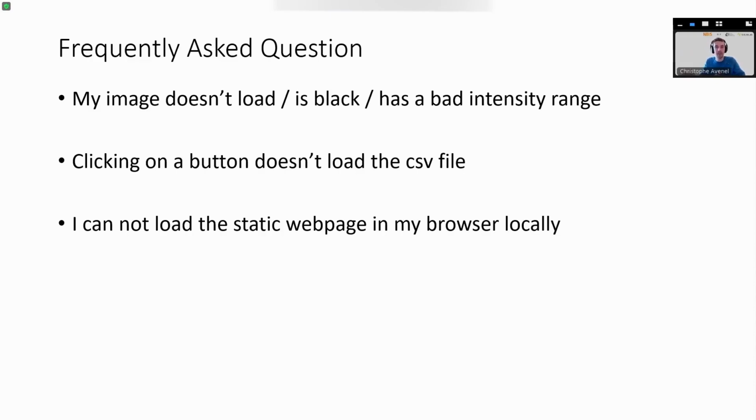But sometimes it can fail. It can fail to find the correct range, or your format is not recognized by TissUUmaps at all. And TissUUmaps is using the VIPS library to convert it, so some images are just not supported. So the best thing is to use other tools that are good in converting images. For example, you have Bio-Formats. In ImageJ, you can load your image and export it into a format like TIFF in 8-bit, so that you can choose your range as you like it to display it in TissUUmaps.